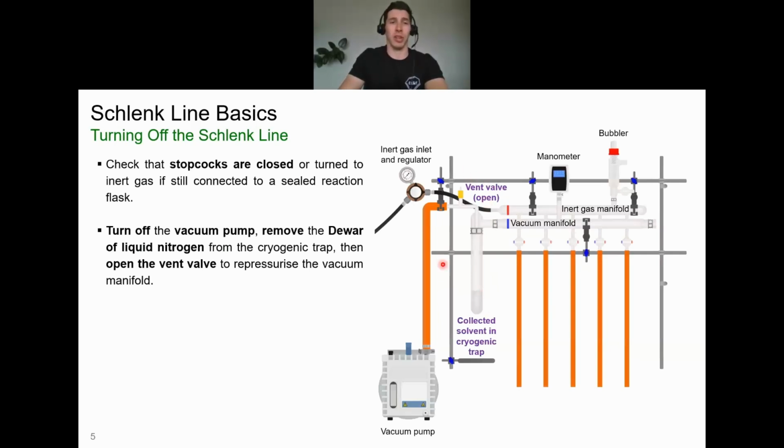Now, these are done often in quick succession, so the exact order doesn't matter too much. It's just important that you never open the vent valve when both the pump and the liquid nitrogen Dewar are there, because we run the risk of liquid oxygen contamination.